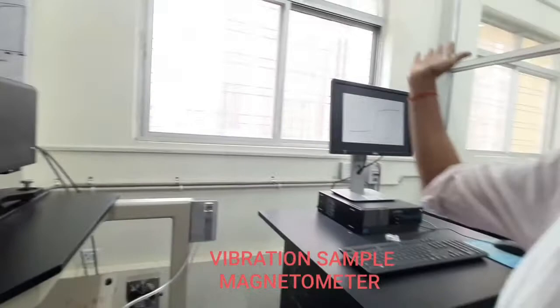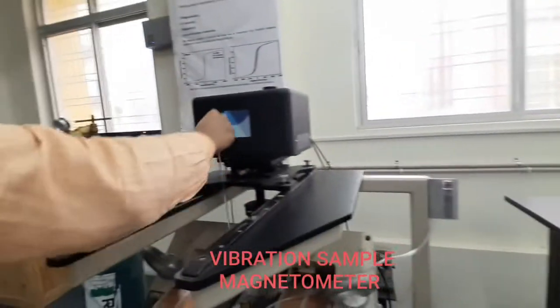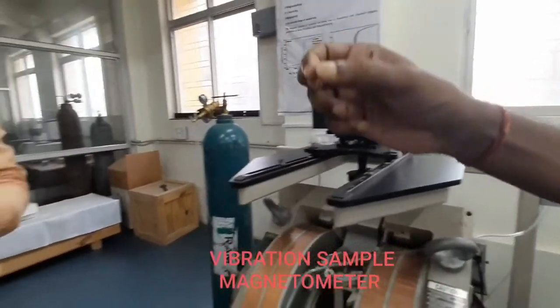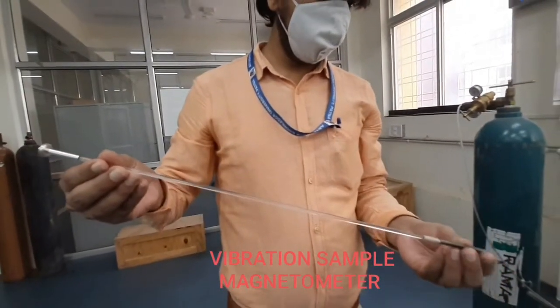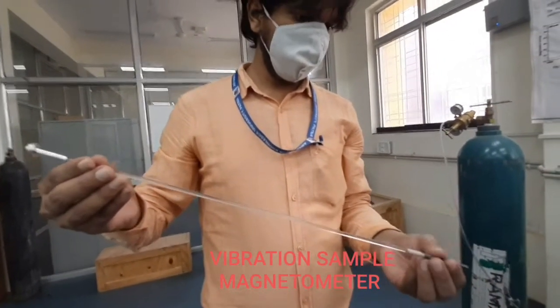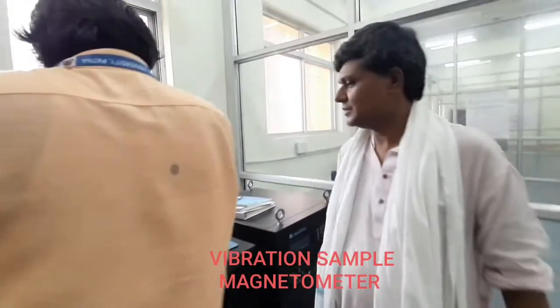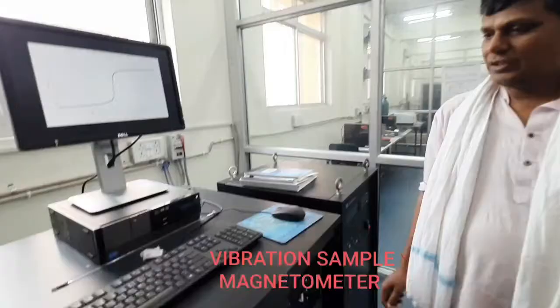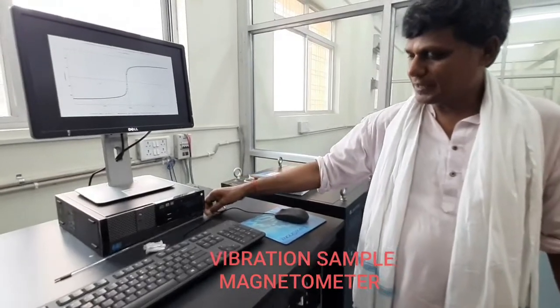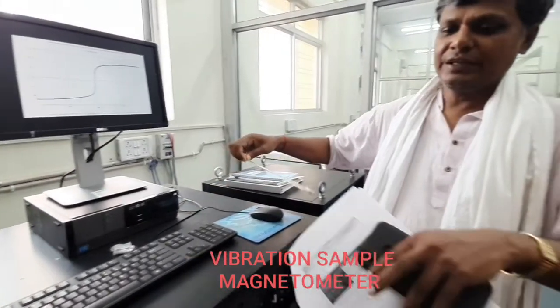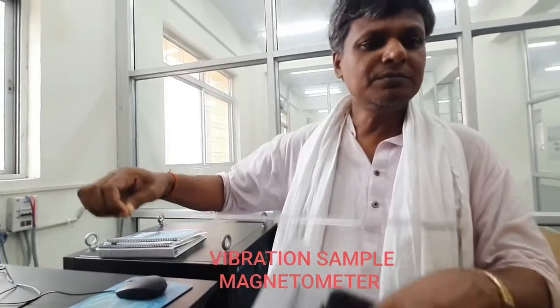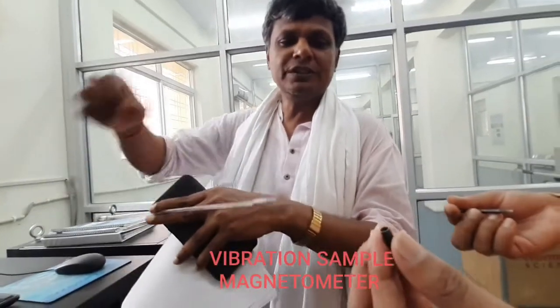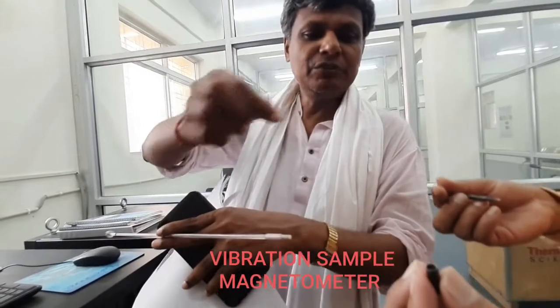Where we can see the results. Now first, this is the sample holder. In this sample holder, you put the samples in powder form. You can see the sample holder, in this sample we have just put the sample.